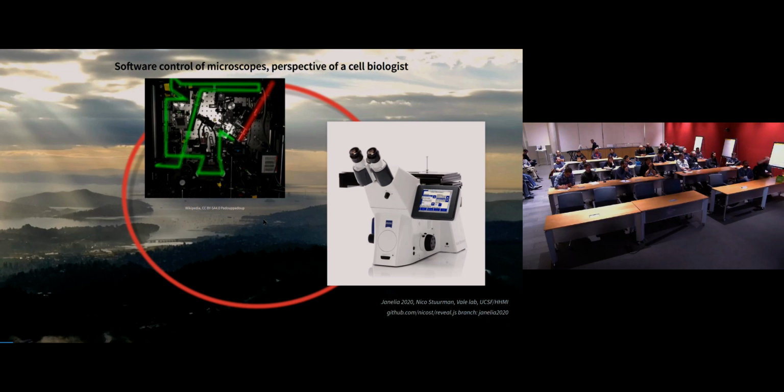But on the other hand, as microscope builders here, what a pain and how much work it is to actually write that code, even the experimental code, to run these microscopes. So there is a big gap in my mind of easily shareable tools that all of us can reuse to make these advanced microscope systems directly accessible to everyone.